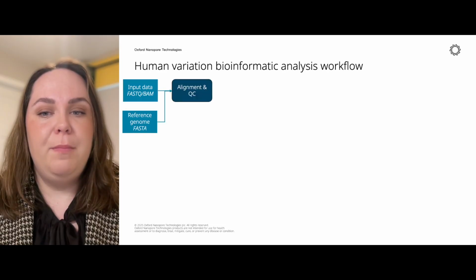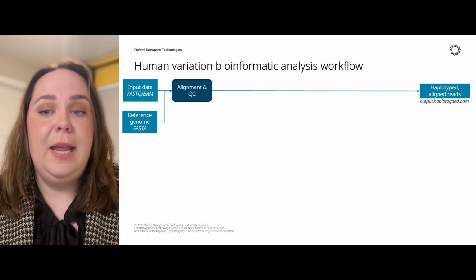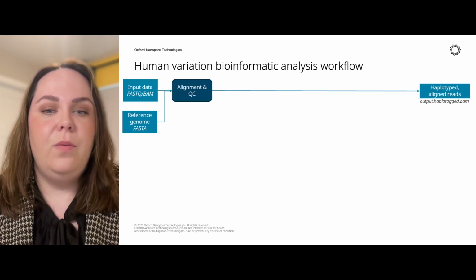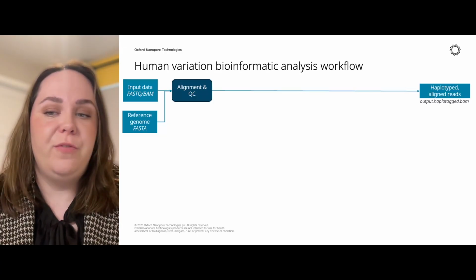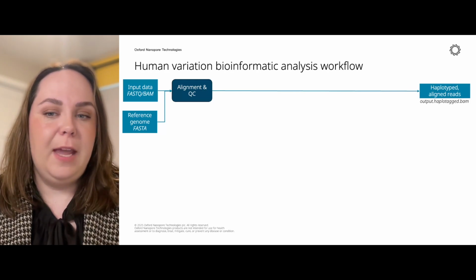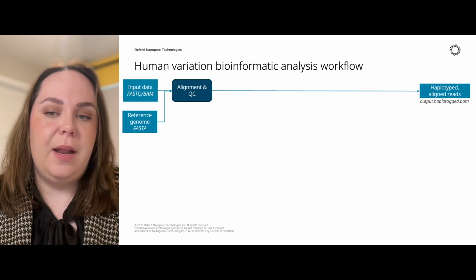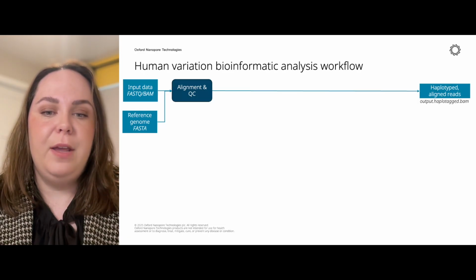Following the initial input checks, the workflow performs alignment to the reference genome. Quality control and alignment statistics are output into an easy-to-read report, along with the expected aligned BAM files that are tagged with important information for each read, including mapping location and quality, modifications, and haplotypes. Based on the modules you select during setup, the workflow will proceed with variant calling using state-of-the-art variant callers.